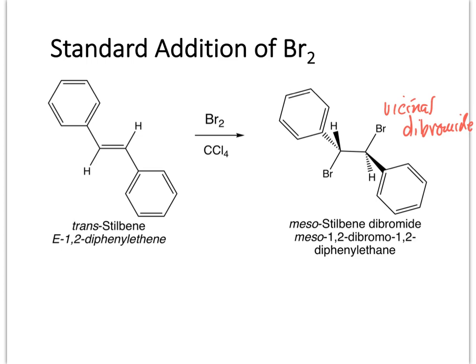One has to do with the bromine itself. Bromine itself is very reactive, and so we don't like to use a lot of molecular bromine. The worst lab accident we ever had, and this was more than 30 years ago, involved a student handling molecular bromine, not wearing gloves, even though the student had been told to wear gloves. And the student was holding the bottle of molecular bromine. Molecular bromine is a very volatile liquid. The heat of the student's hands boiled the bromine. It came out of the bottle, down the side of the bottle, across the student's fingers.